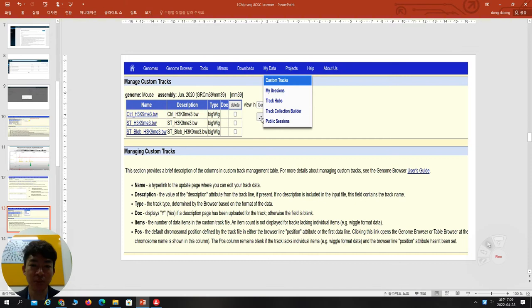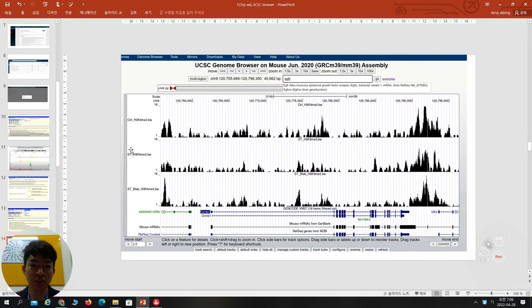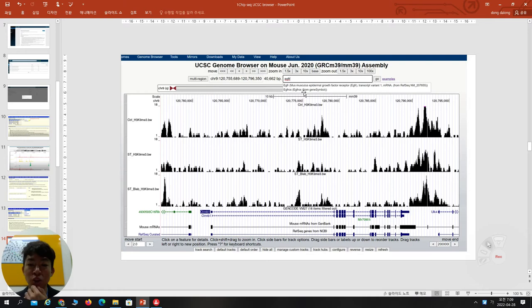Now you can see these three files here. When you go to visualization, you can have these three groups. This is some ChIP-seq data, and you can modify everything in this browser — the Y-axis and the X-axis. You can see this is some chromosome 9, and you can search in the bar here. If you want to go to a specific gene, you can type 'EGFR' and go. You can also add or change other public data.